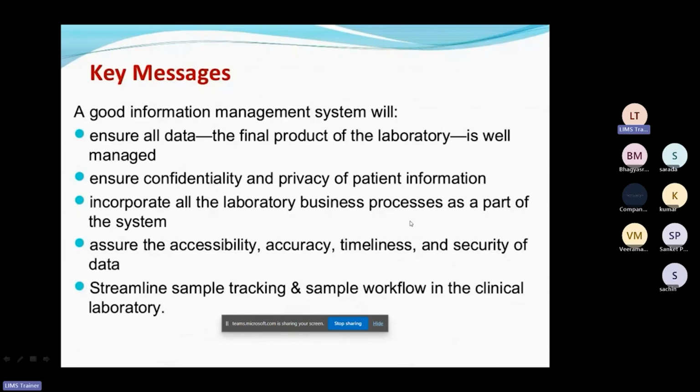Whatever environment we have created, the laboratory and the laboratory information management, all the business activities will be incorporated into this. Then we assure the accessibility: the reports or the results must be easily accessible to whoever is in need.